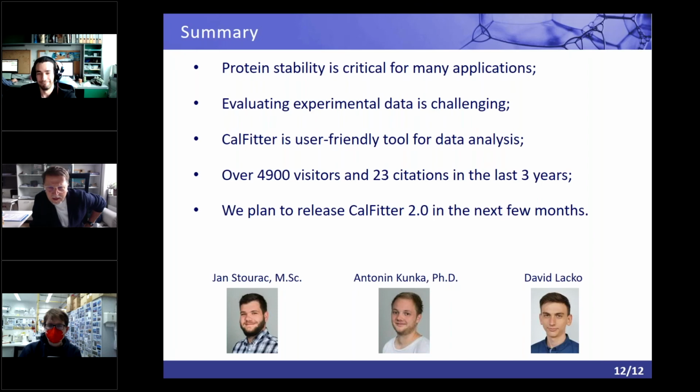Okay. My question is, you can upload your own data and get the analysis. So is there any requirement for the quality of the data? Can you, for example, upload CD spectroscopy data for the denaturation that is ready to fit? What do you mean, already fitted? So you mean already processed, pre-processed? Yeah. So do you have any requirement for the format of the data or the quality of the data?